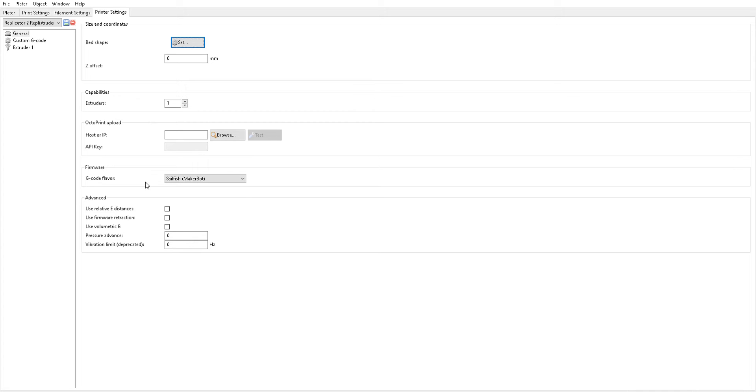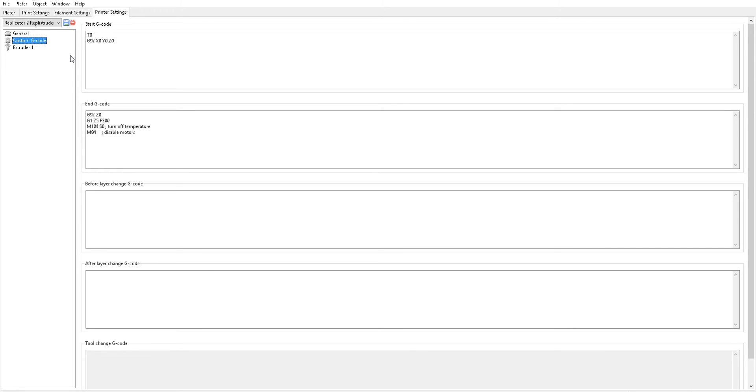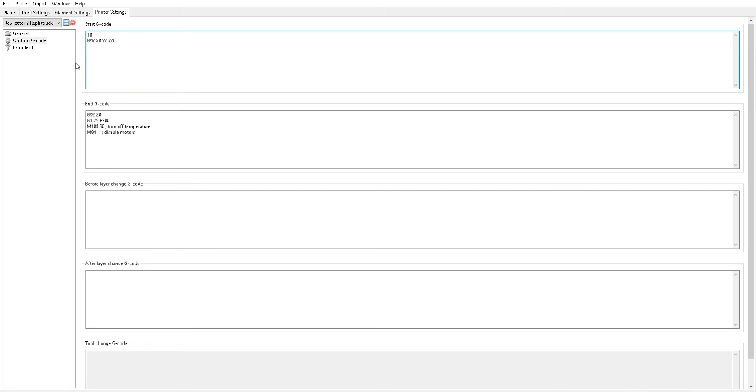Down for G-code firmware you want to have the Sailfish firmware flavor installed. That's just part of our setup that we detail externally and have all this basically reset as it is at zero hertz. Custom G-code, this looks a lot more minimalistic in comparison to plastic prints, and keep in mind that's because we don't have to tell the printer to heat up any extruders or the bed platform anymore. We don't want it to home because that could knock over your container. You just want it to, as I said, press print and go, because you are the one who is centering the needle aka nozzle right in the middle and the bottom of your support material. So all of our G-codes just reflect this. So you set your temperatures to zero, you tell the printer that its current position is now the origin, which is again reflective of what I've been saying. And your end G-code is also now saying right when you're finished you are now at z zero, raise the nozzle by half a centimeter, and this is just to allow you to take the print out from underneath the needle. And then you're going to turn off all your temperatures and disable your motor just as a precaution.